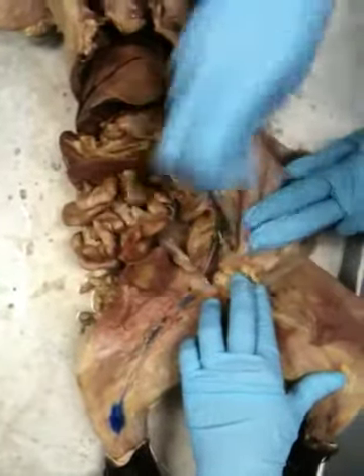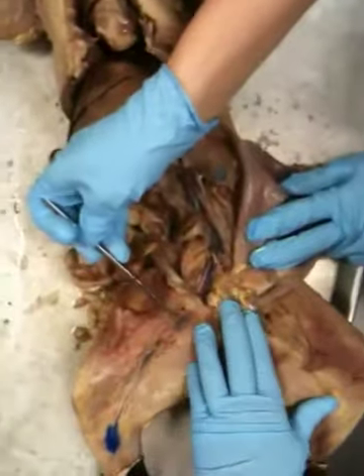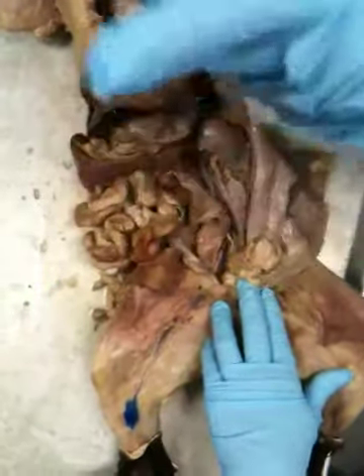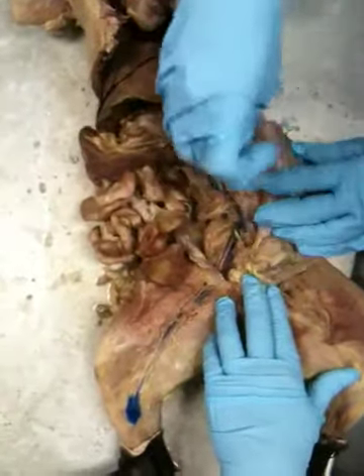But you do need to know, if I tag down here, external iliac, femoral, but I probably won't do anything with the common and the internal on that. I'd use the model because it more represents what the.